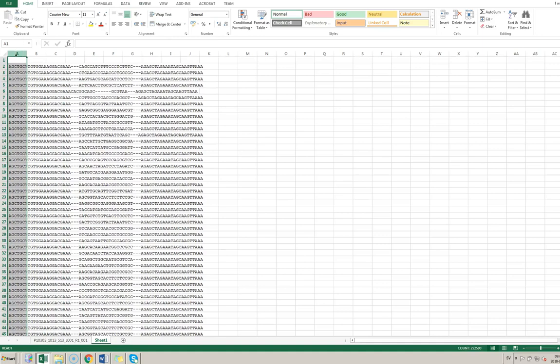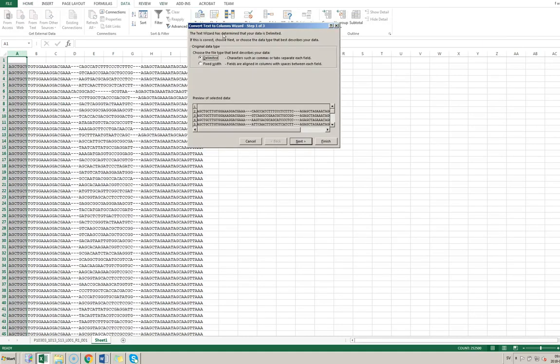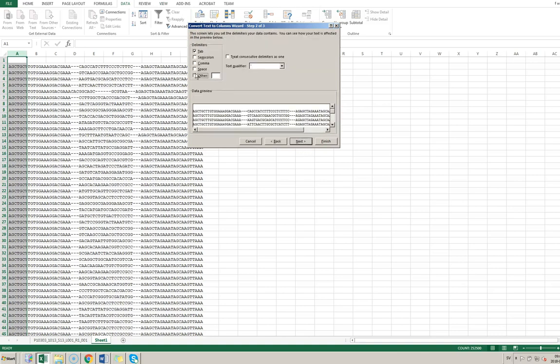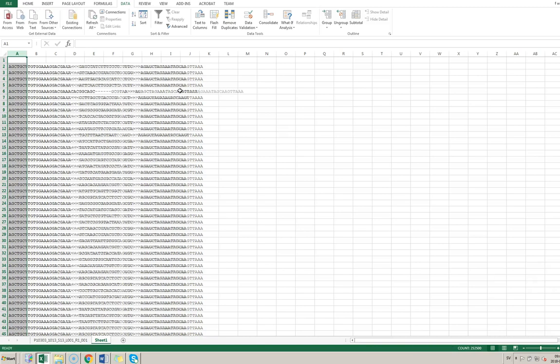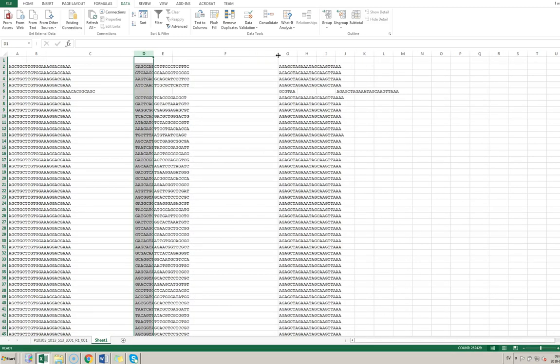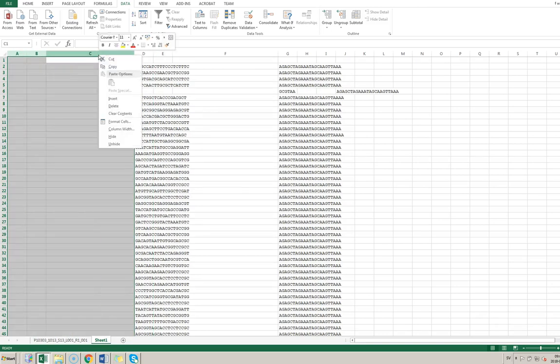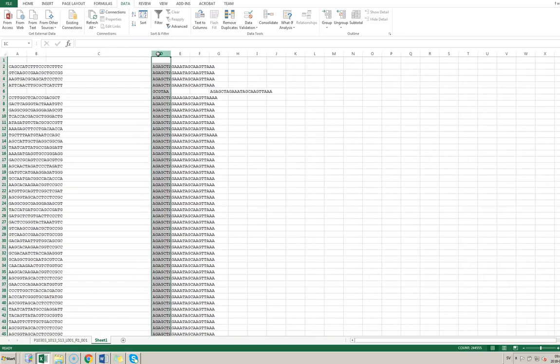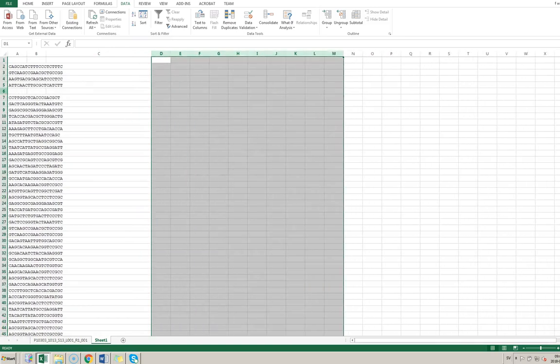Now I'm going to label this column again, then go to Data > Text to Columns > Delimited > Next, and select 'Other' as the delimiter — using the replacement characters we inserted. What now happens is that the actual guide RNA sequence gets separated into its own column. You can see that some reads are lost because of errors, but we are actually able to extract just the guide RNA sequence.